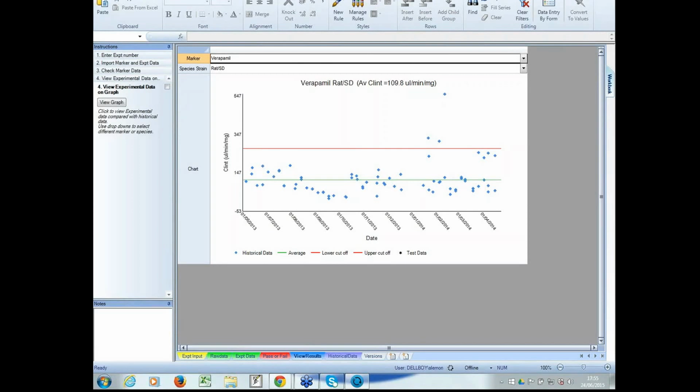The next question regarding the Z prime, can I store these values for looking at later? Again, I guess that's really the same question here. Yes, you can. So if you're running a series of plate-based experiments and you're evaluating the quality controls over the plates and you're doing a large run, we have both automation tools which can process those plates automatically and also post you up a running monitor of the Z prime. And we can also, of course, store the Z prime in the database so you can then search and look for trends over time. That goes for both things like quality control like Z prime, but also the performance of controls and standards, so you can monitor long-term quality against your assays.